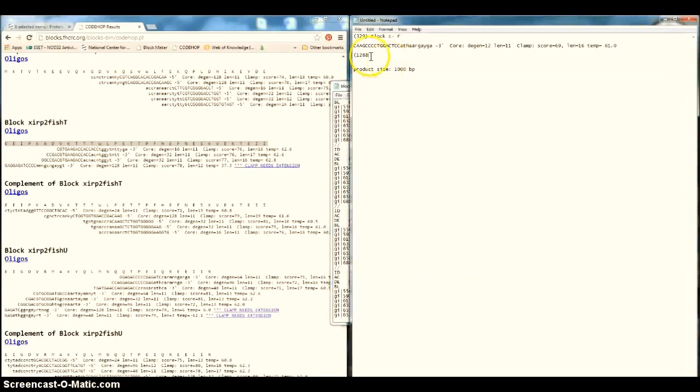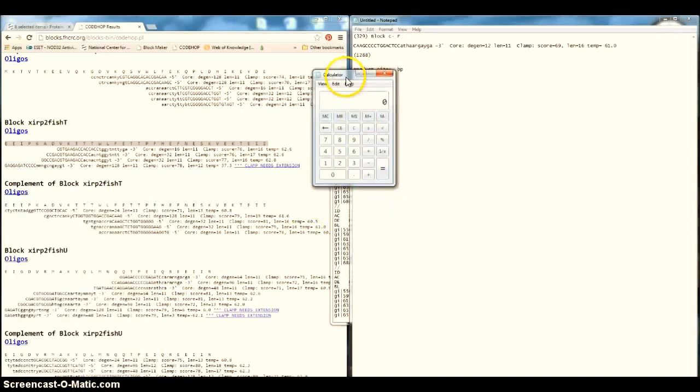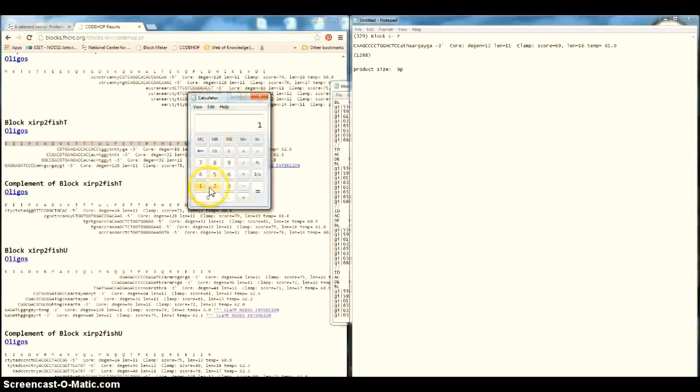so it will help us to calculate the correct location. So it will not be 1000 base pair, but let's show you how much. 1288 minus 329, it's around 959. So it's nice, it's not a big deal. So let's find the reverse primer.